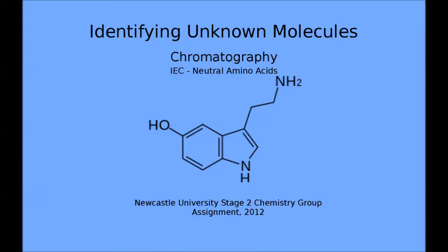The acidic amino acids with their 2 carboxylic groups are eluted first, followed by the neutral amino acids and then the dibasic amino acids that tend to be held so strongly that they often require further analysis in another column using a second sample and a strong eluent.